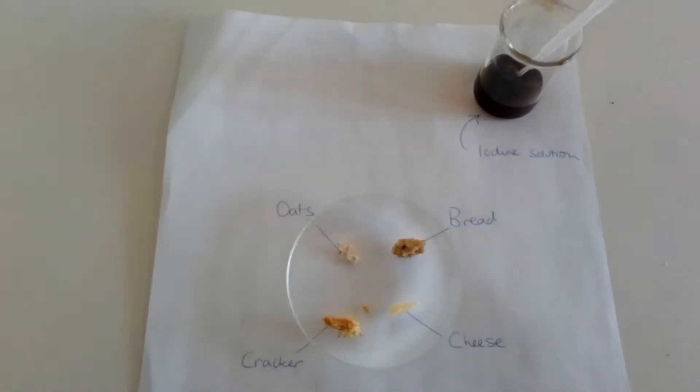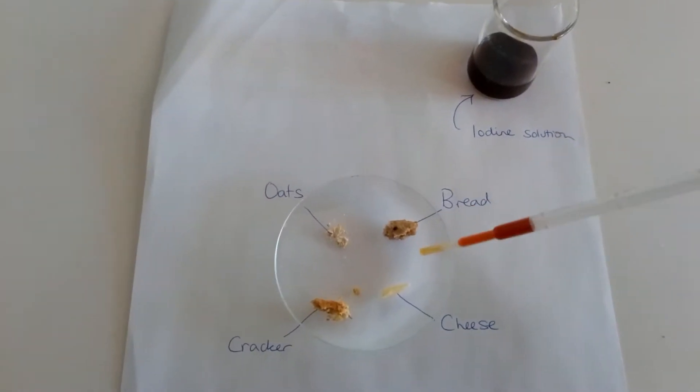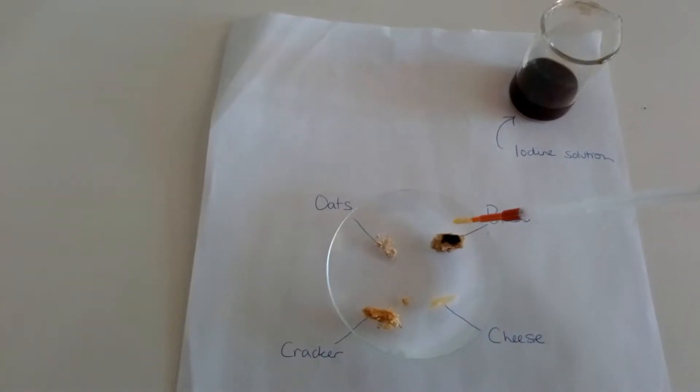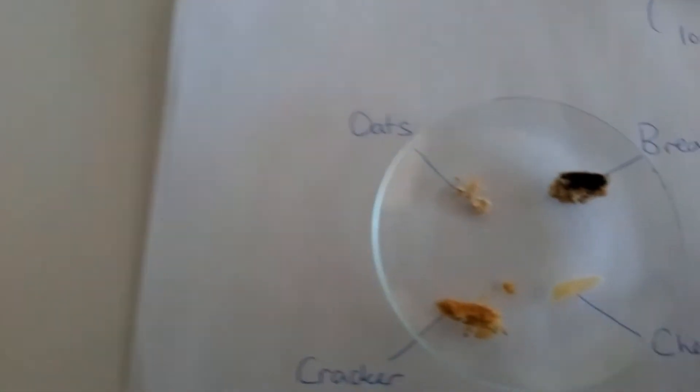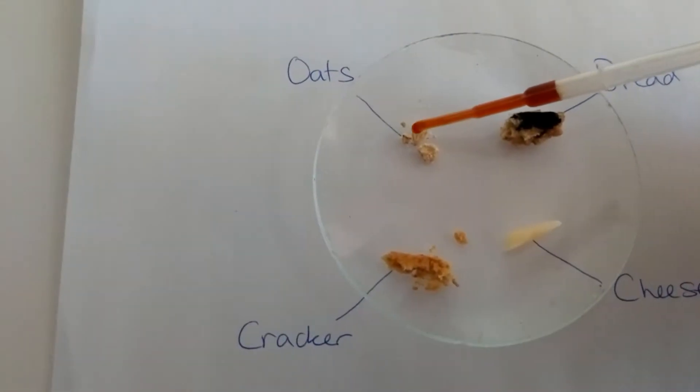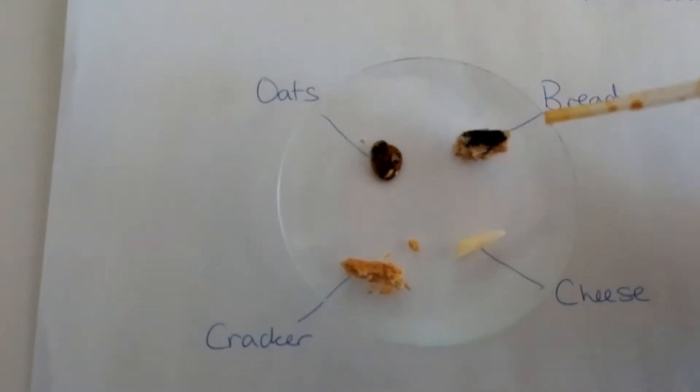If we take a little bit of the iodine there, you'll see it's the orange brown color, and pop that onto the bread. You'll see immediately that has gone a black color. Put it on the oats, same again that's gone a black color.